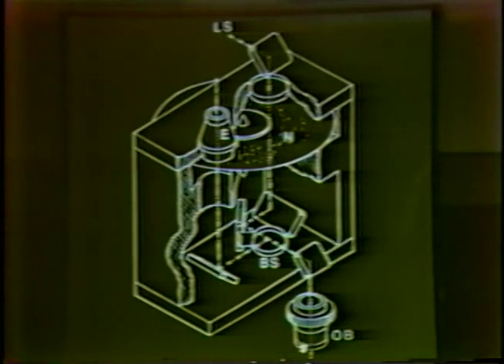The returning light comes back through off this mirror, bounced off the beam splitter here, off a final mirror, and is imaged onto the disk on the opposite side, where the disk is examined by a Ramsden type eyepiece, that is an eyepiece which focuses in front of itself, looking at the plane of the disk.